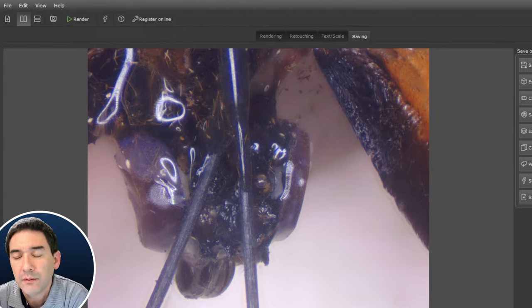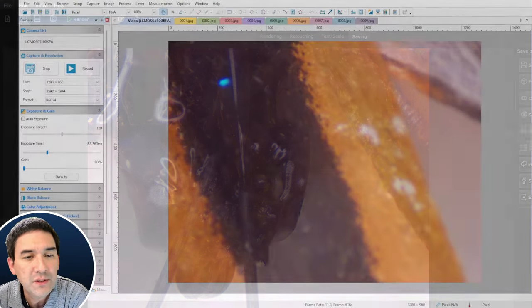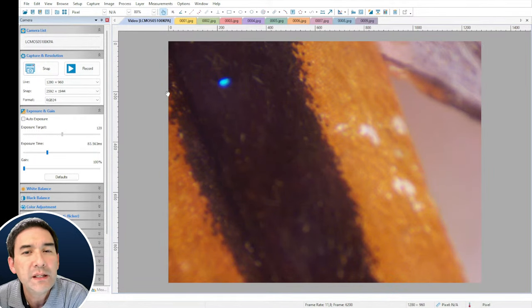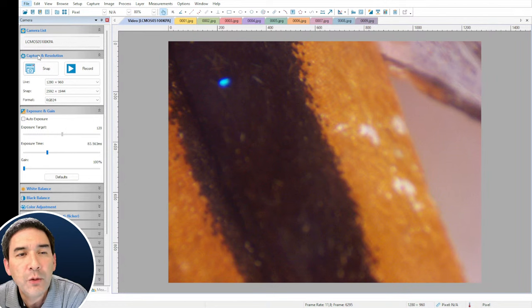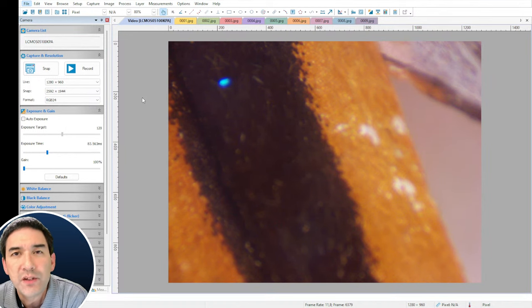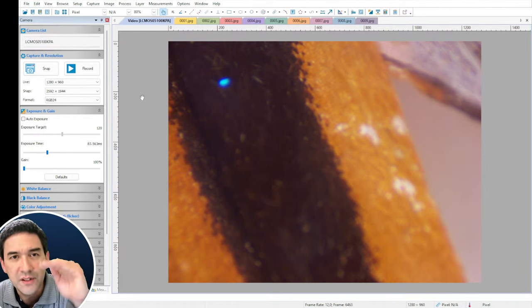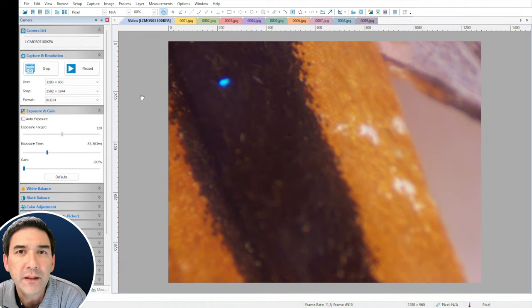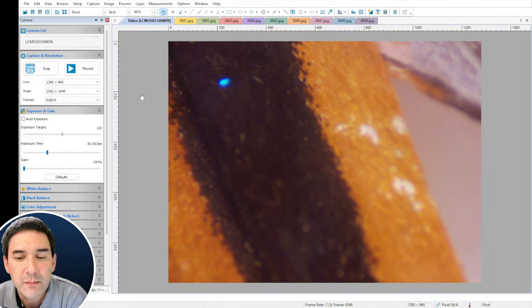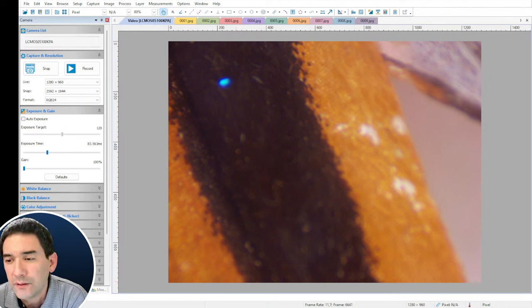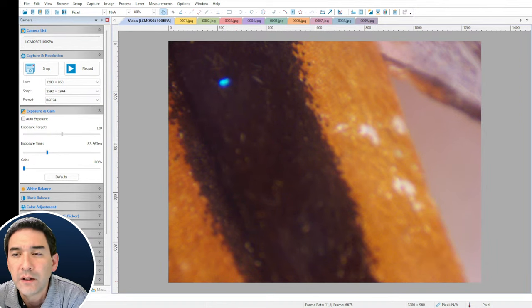There was a question about where the batch save is. Going back to TubeView — File > Batch Save. It's grayed out now because I already saved it. But you can also save all images individually, just make sure you number them correctly. As you focus down, it has to be correctly numbered, and then you're able to quickly import into Helicon Focus and generate images using the different methods.